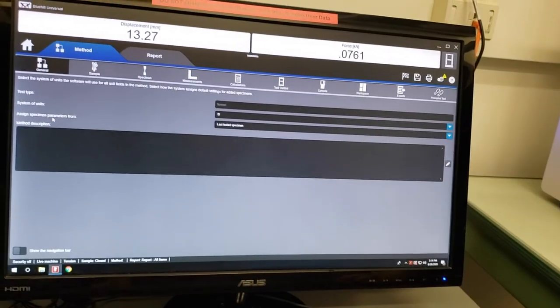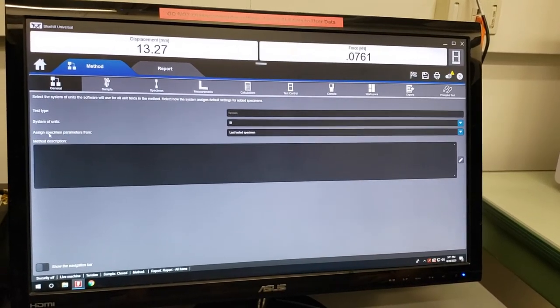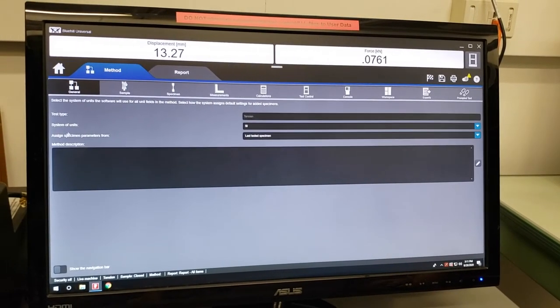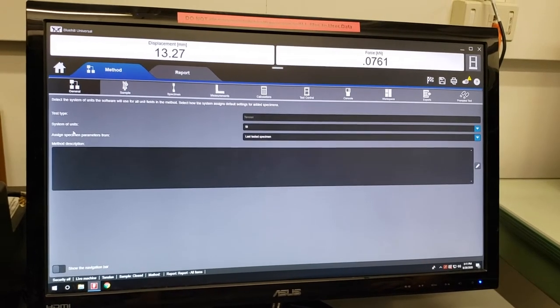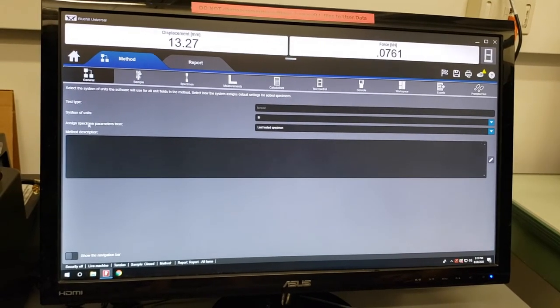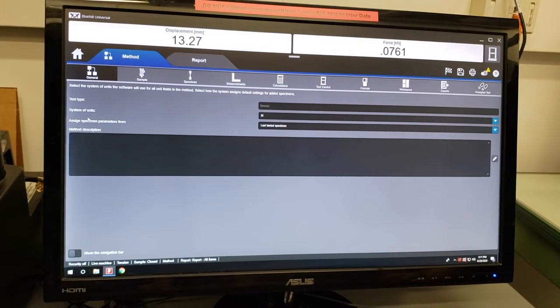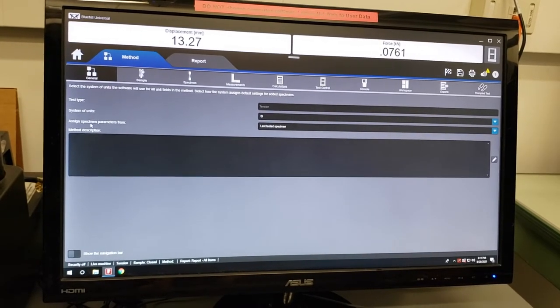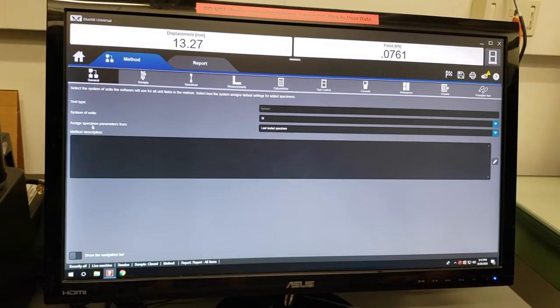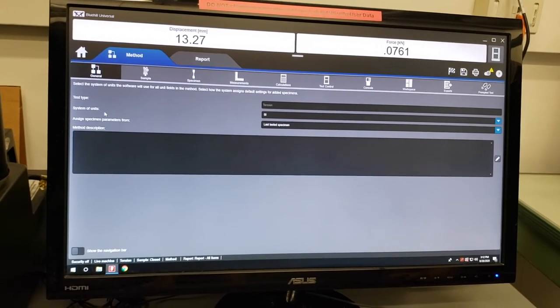Assign specimen parameters — a couple of definitions unique to Instron. A specimen is an individual. If you have a group of 10 things you want to test, you have 10 specimens. The group of 10 is called a sample — so you have one sample of 10 specimens. It's really important to keep the difference between specimen and sample clear when working with a method. I would recommend using the method default because we will go through and create those defaults right now.